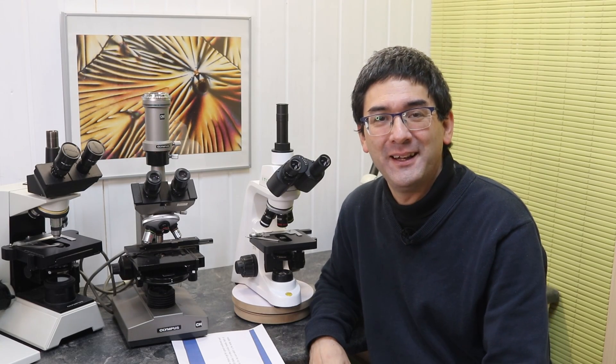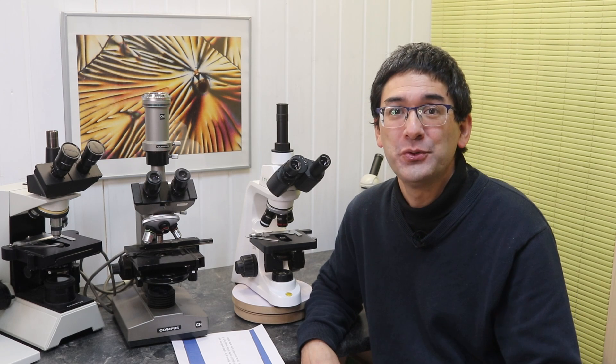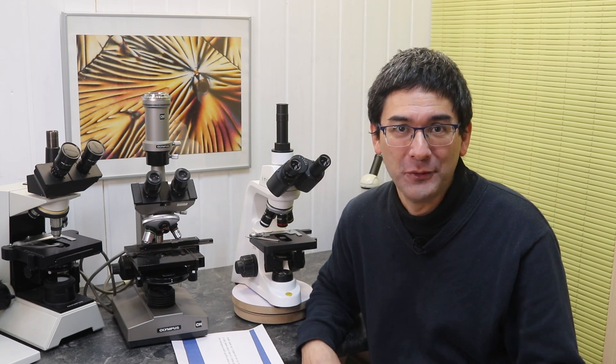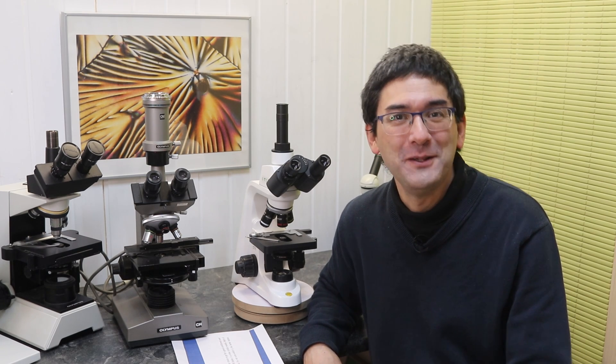Hi, MicrobeHunter here again. Today I'd like to talk about one of the maybe most hotly debated topics in the field of amateur microscopy, and that is should you buy yourself a new microscope or should you buy yourself a used refurbished microscope if both of them cost the same amount of money.